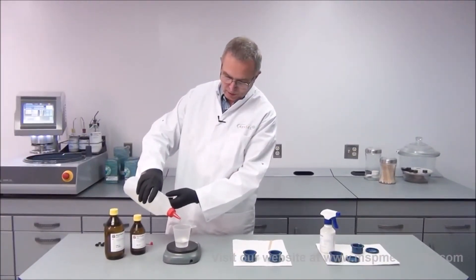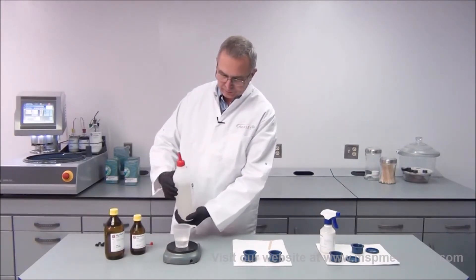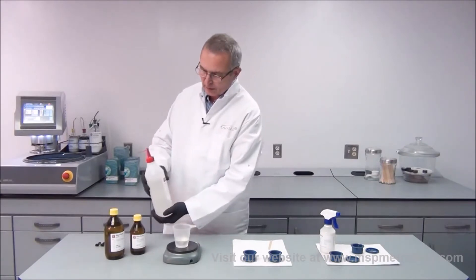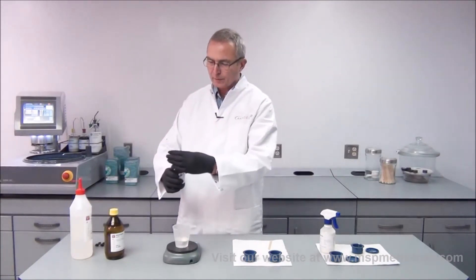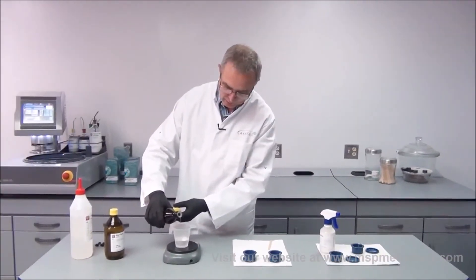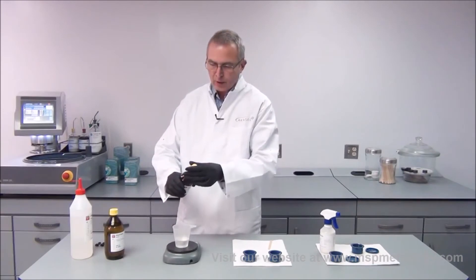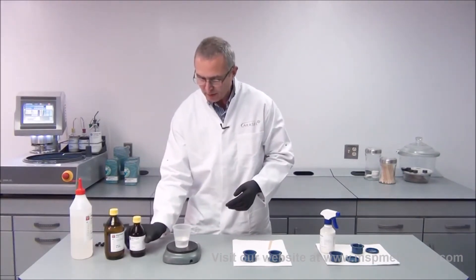Towards the end when I'm getting close, I go slower to not overdose. I now have exactly 50 grams, and then I use my hardener — I have to fill in 6 grams of the hardener. Again I'm very careful towards the end. I put in my 6 grams of hardener and now I can start stirring.